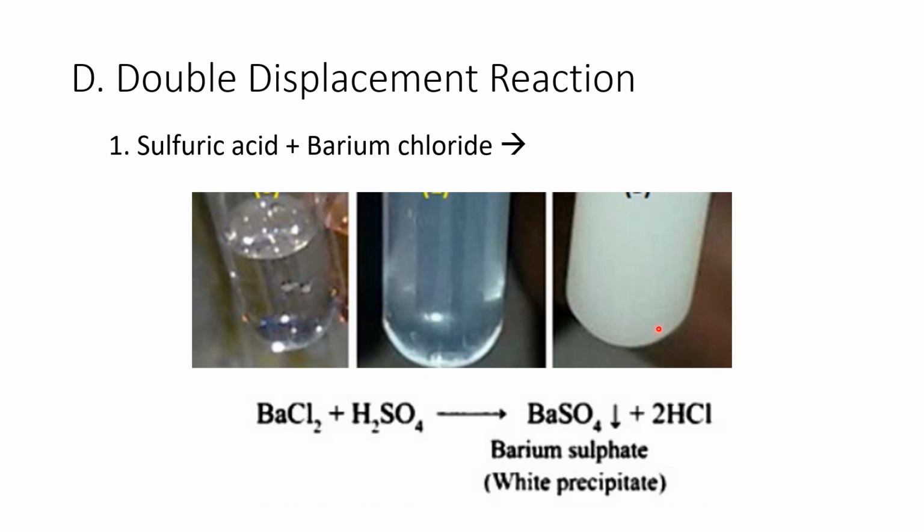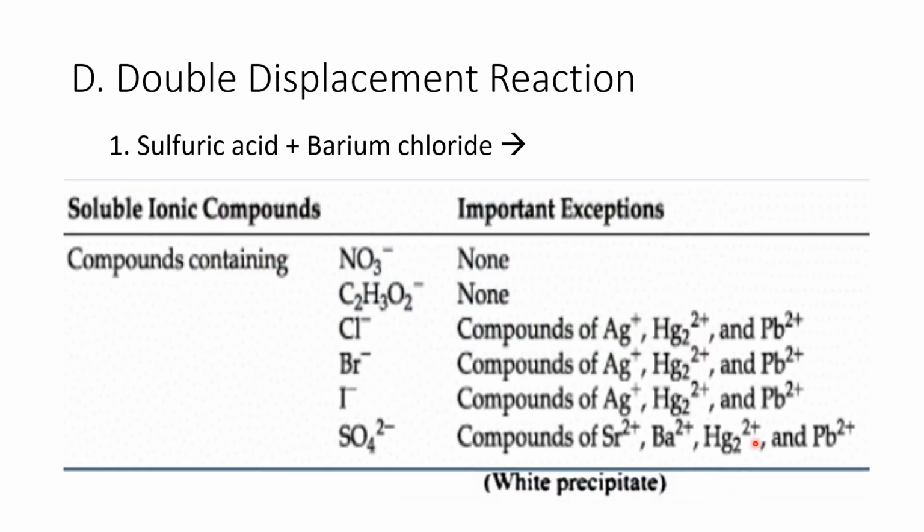Okay, so this is now the precipitate. Tanaw na to, kung alin kaya nag-precipitate. Okay, balikan na to ang table. Okay, take note, sulfates. Okay, sulfates are soluble except if they are compounds of barium. Okay, so barium sulfate is the insoluble precipitate in this reaction.